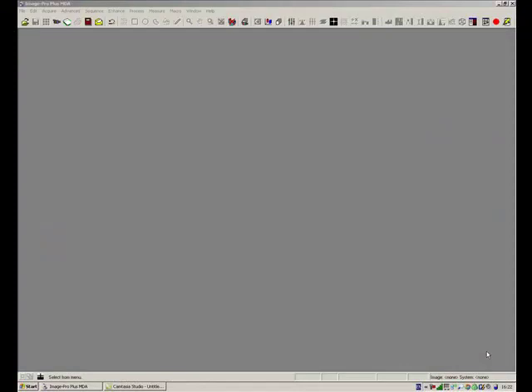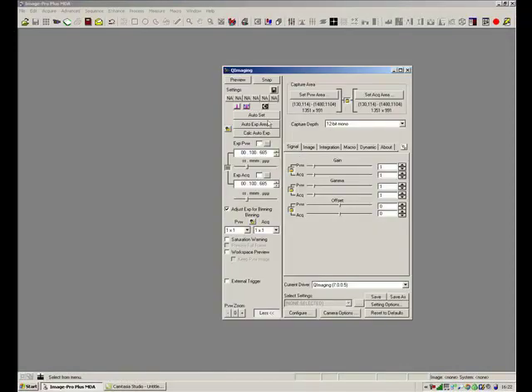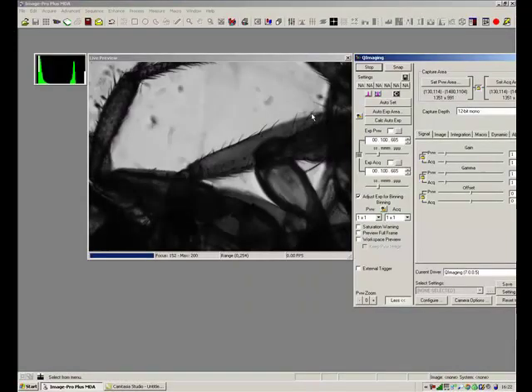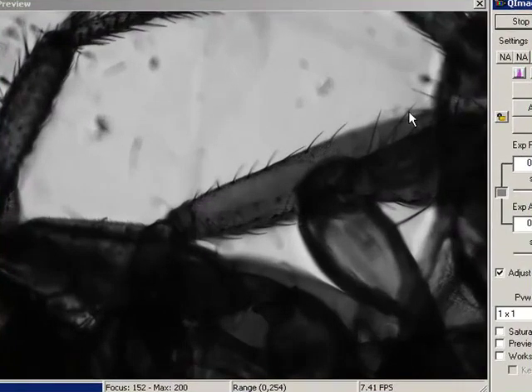This is a quick movie just showing you how to use the new Extended Depth of Field tool with Image Pro 7. It's actually Live EDF.